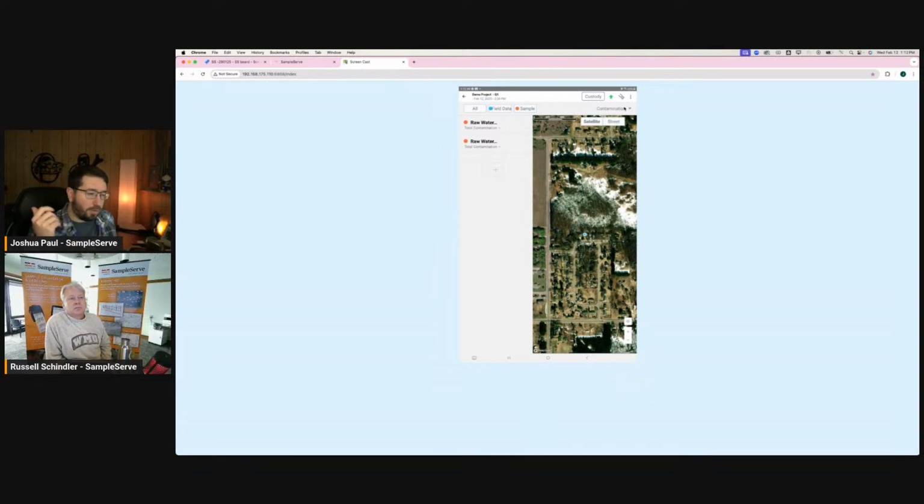Yeah, so if you're doing low flow sampling, you're doing your stabilization readings, it's just going to pull in that data automatically from that meter. It'll start a new calculation, and then you kind of just sit there and watch it happen. That's really nice. Set it once, and it'll tell you when it's stable. We use the US EPA stability calculations in there, so it'll do all the math for you. And when you're stable, you get that 3 in a row, and then that certain percentage, the number will turn bold and green. And once you get them all green, you're ready to take the sample.